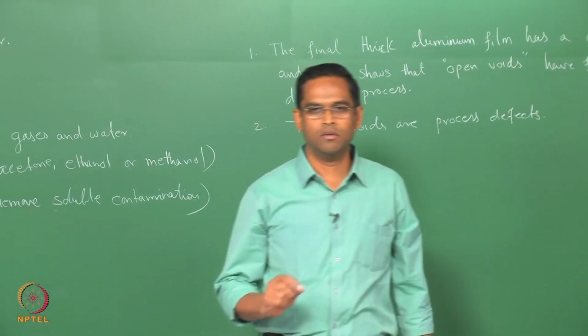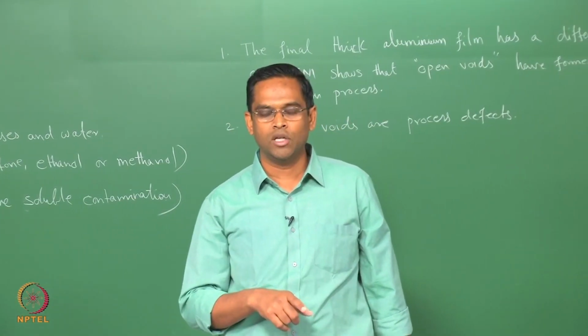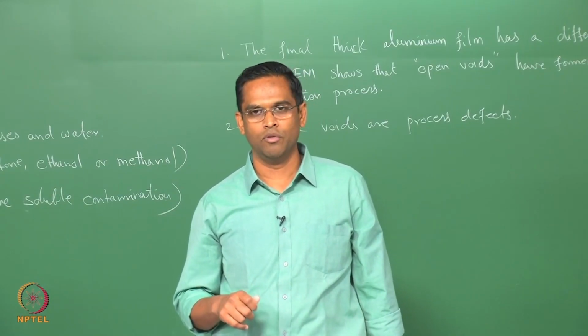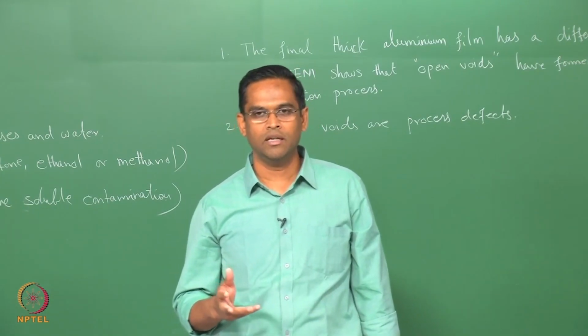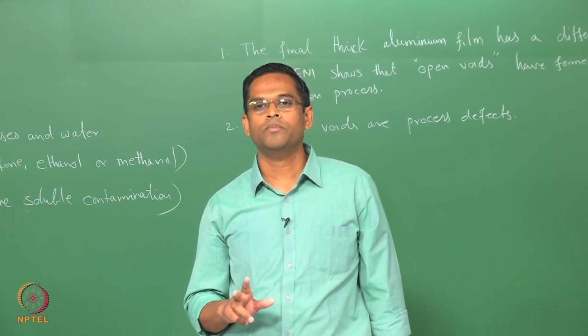So, the first and foremost important point to note here is the first spectrum is recorded on the grain, the second spectrum is recorded from the grain boundary. So, you can see that in the grain boundary you are seeing additionally magnesium and silicon. So, there are 2 things you can infer from this result.